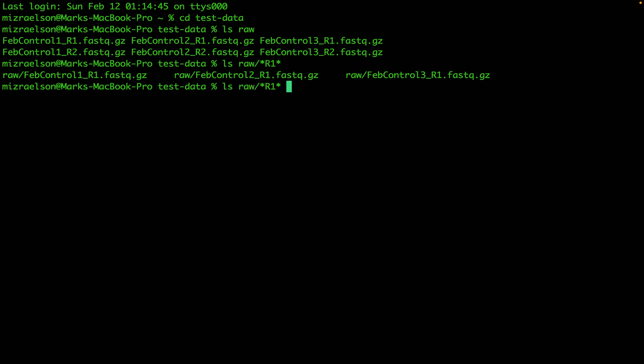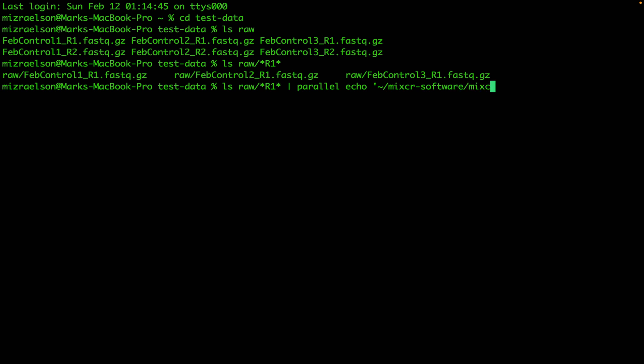I'm going to type list files and I'm going to put pipe. That symbol means that the output of the command on the left, which is the list of files, will be passed down to the command on the right. Type Parallel Echo MyXER Software, which is the folder where I have MyXER.